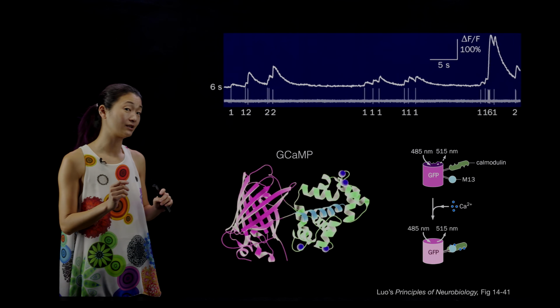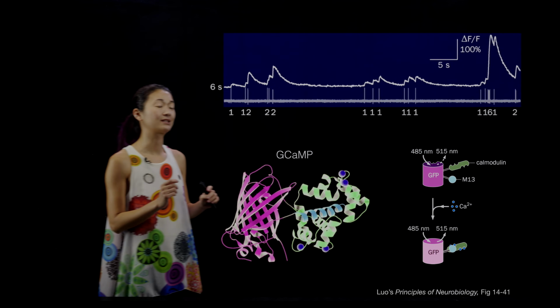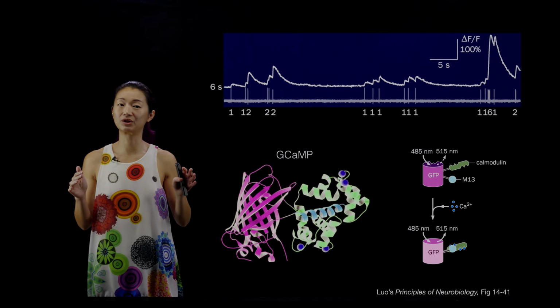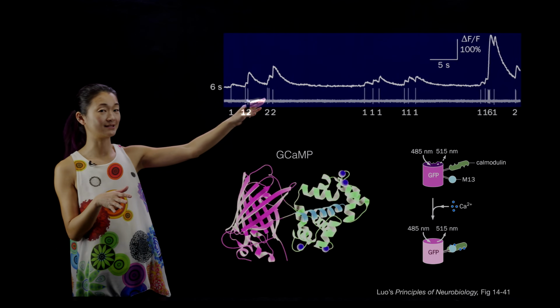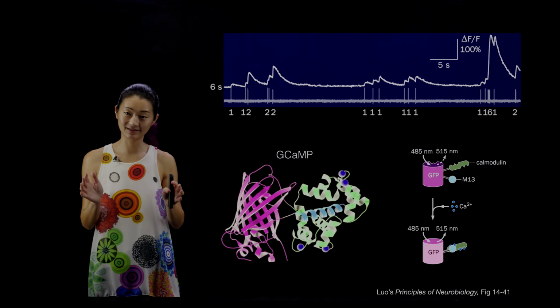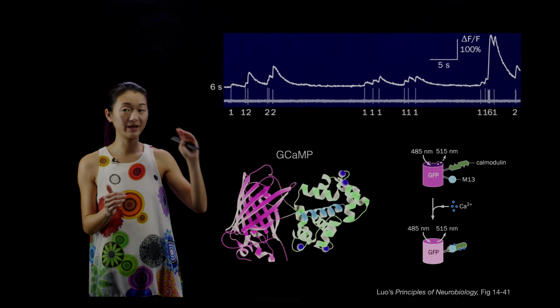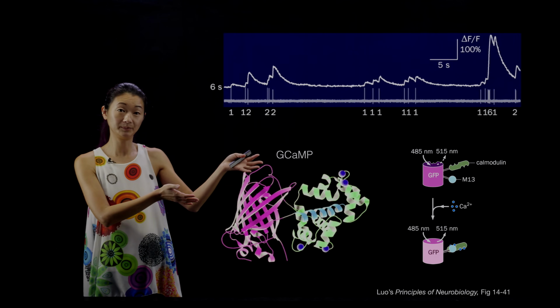The second thing that I'll point out that's really interesting about this type of system is that the signal does not actually become proportional to the actual fluorescence. If you pay attention to the axes there, those of you who may be astute have noticed that we're not actually plotting the fluorescence of GCaMP. Big F is fluorescence. So we're measuring through a microscope the photons that are coming out of the cell.